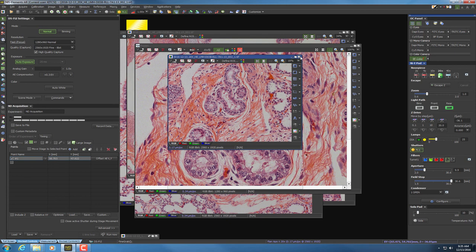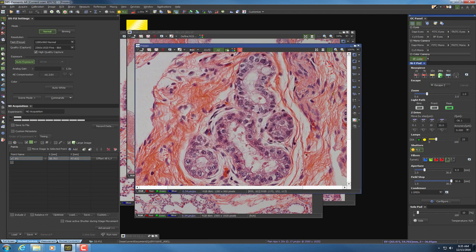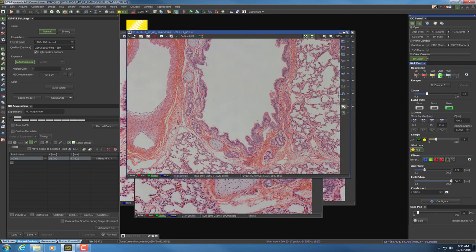We're done for this session. Normally you would take about five images per magnification. You might also want to get images of the alveolar regions without the airways. This has been a quick tutorial to show you how to use the Nikon Brightfield microscope to take pictures of H&E and histological stain slides.